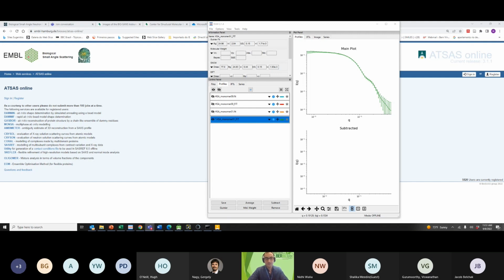If you have some kind of incoherent scattering that's not really well understood, some kind of extra affecting our sample, you should see some difference in the high Q, because that is not the contribution exclusively from the type of incoherent scattering that we talk about. Yeah, it could be an artifact of the measurement. Defining what your Q max is, where you're getting reasonable data, is important.